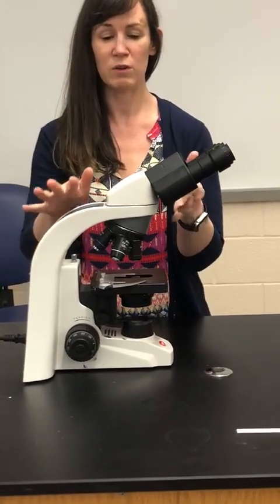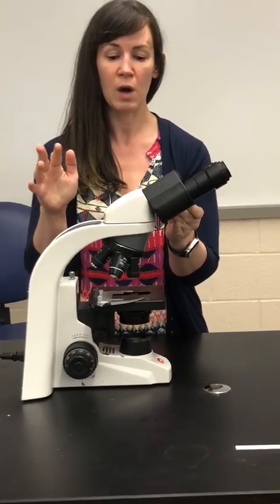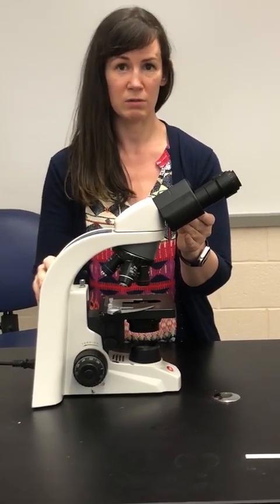Now I'm going to talk about the different parts of a microscope. We use microscopes a lot in the micro lab, so it's important that you know all the different parts of the microscope, what they do, and how to correctly use a microscope. So we start from the top down.